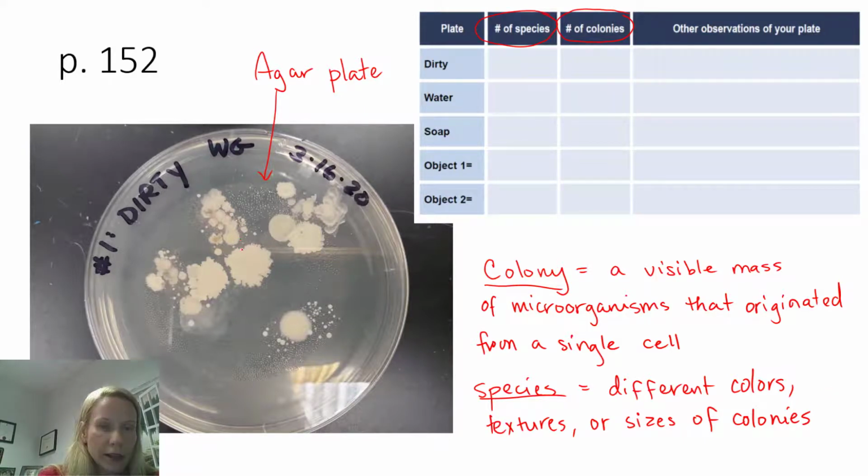So we see that we've got this big jagged edged guy, right? He is one colony actually, but huge. That's a huge one. And we see that there's several others, like here's another one of the jagged edge colonies, okay? And probably one over here as well, and one over here as well. That's a particular species. Okay, here's another one. I see one over here, jagged edged. Okay. Then we see a lot of these little white ones. So that would be another species, second species. So this is species 1, this is species 2.